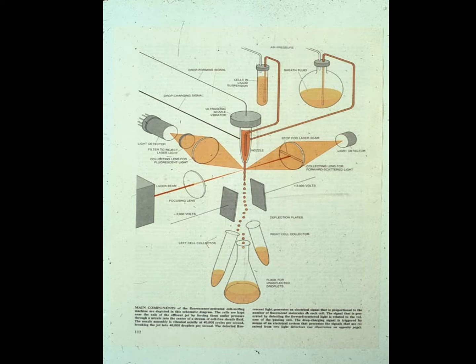This is a standard block diagram showing the piezoelectric crystal, the nozzle, the fluid coming out with the cells in the middle of the stream, obviously, being hit by a laser, and the droplets being formed and being deflected by deflecting plates and collected in tubes below.